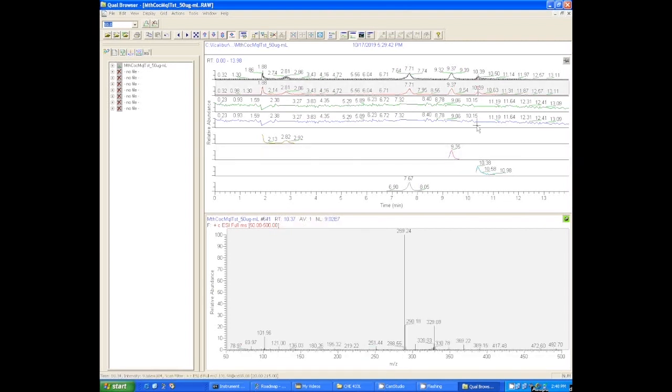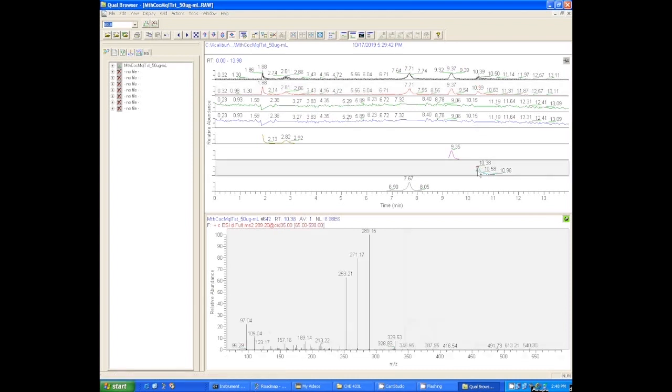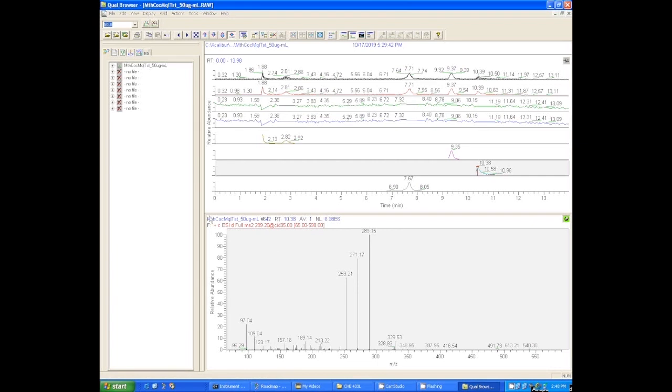We'll go to the MS1 spectrum and see testosterone. We got an MS2 spectrum for that one and we got a lot of good fragments here, so that's definitely going to tell us whether or not we have testosterone.